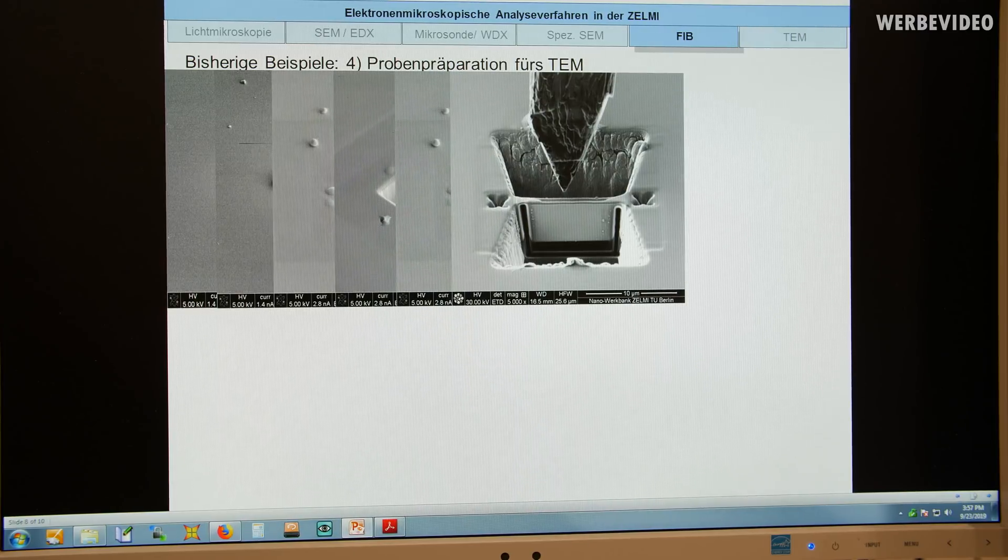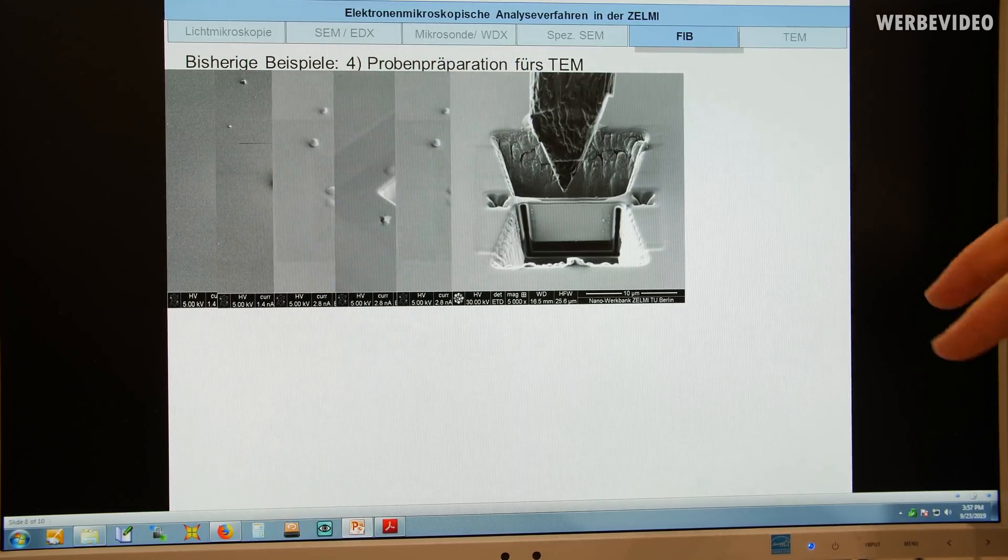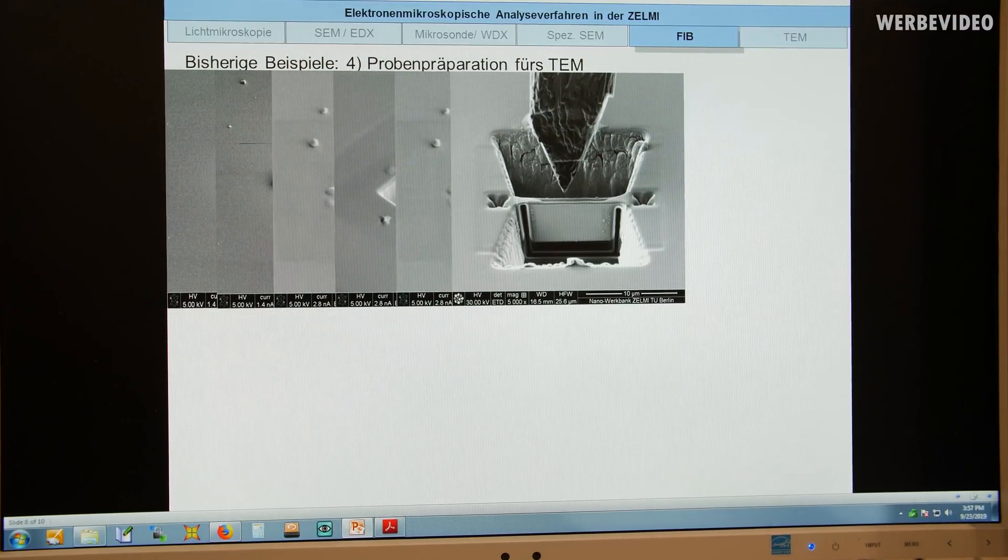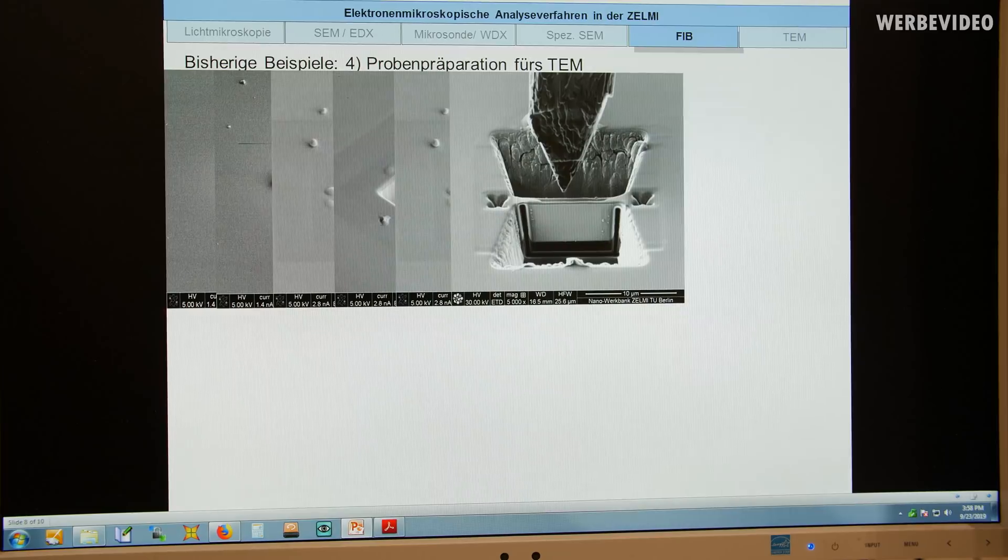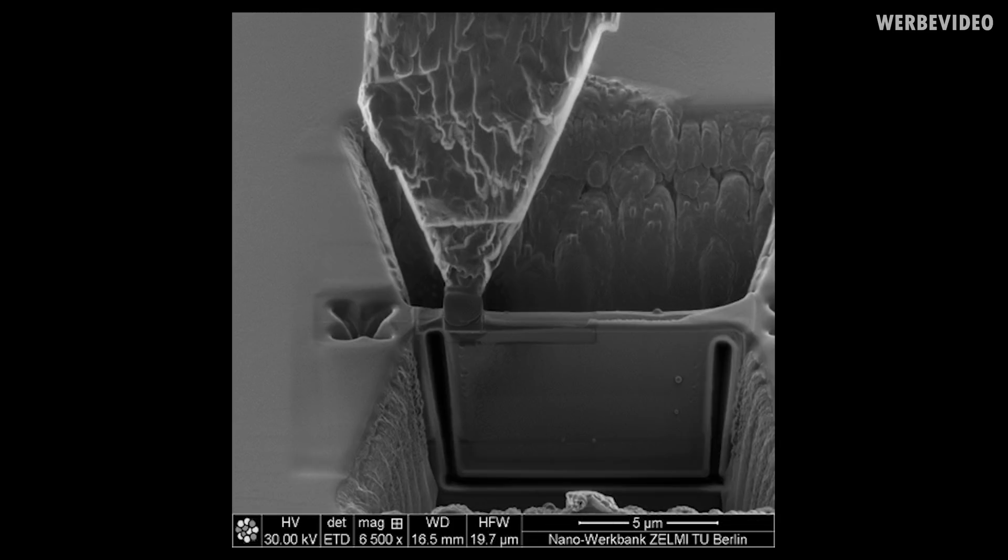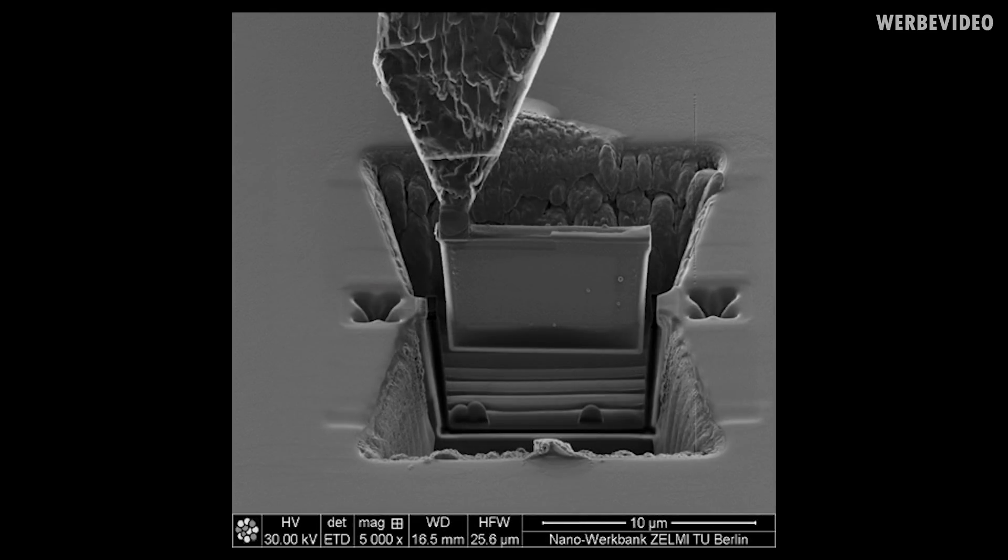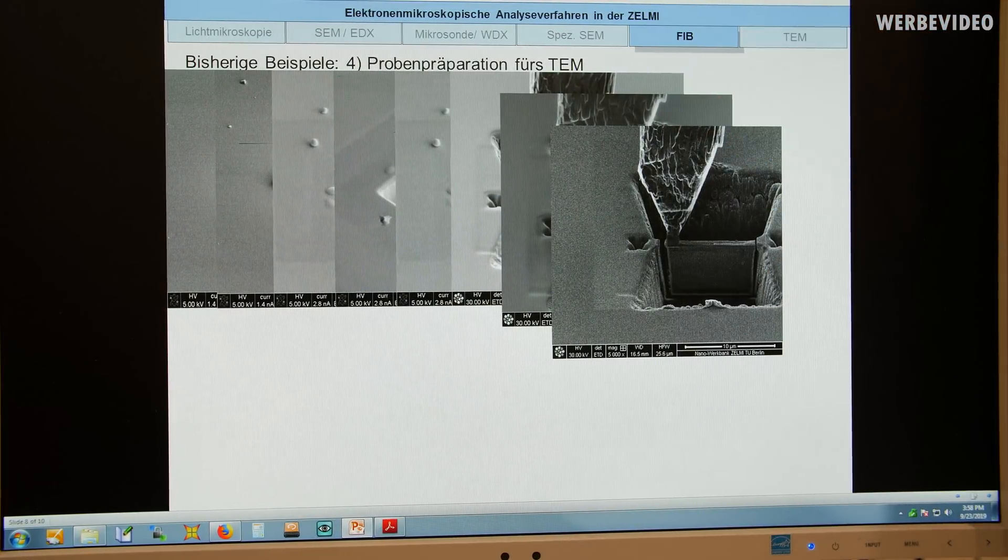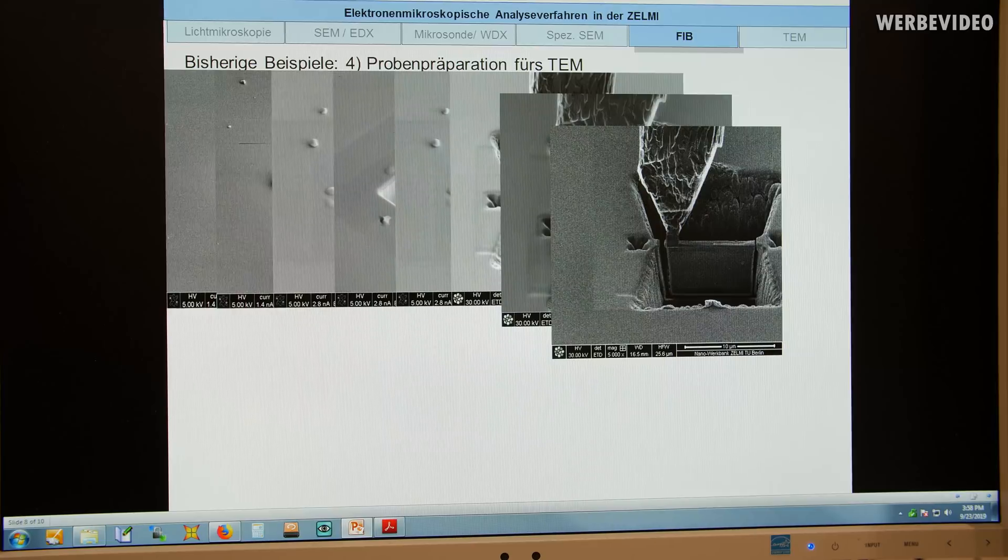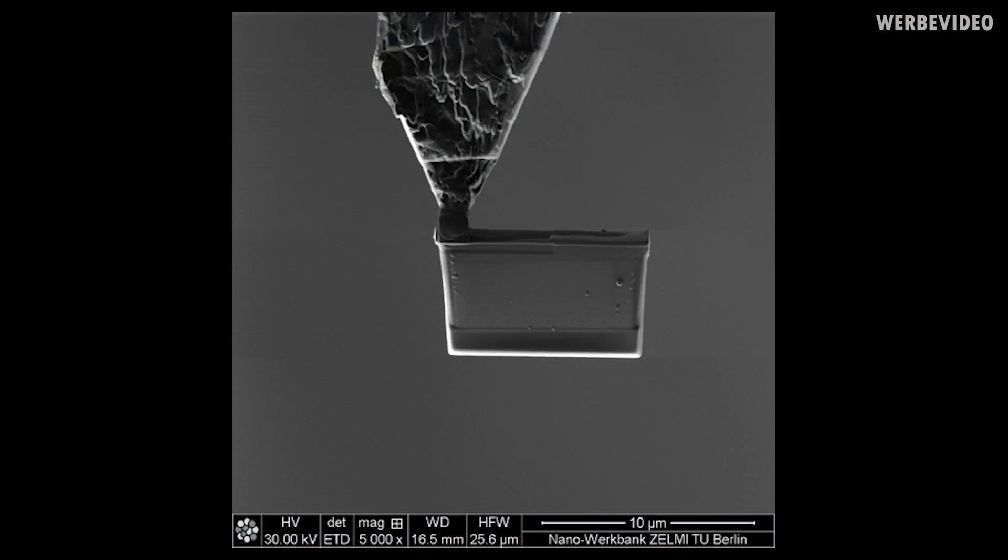So we can't use tweezers or anything else, mechanical tools to bring it to the TEM for the analysis. Therefore, we have this transfer needle. And first we start to cut a U-shape into the specimen, release it from the TEM lamella from the specimen. And now we will fix the transfer needle on top of the TEM lamella. This is just done with a platinum deposition, as you saw before. And now we release the TEM lamella. We cut it on both sides. And then this transfer needle, it's written with piezo actuators. And with this we can release the TEM lamella now. You can see that we slowly move it. And now it's completely released.